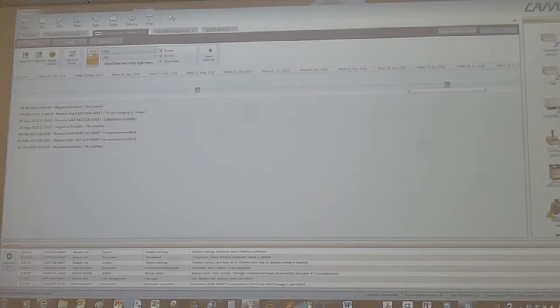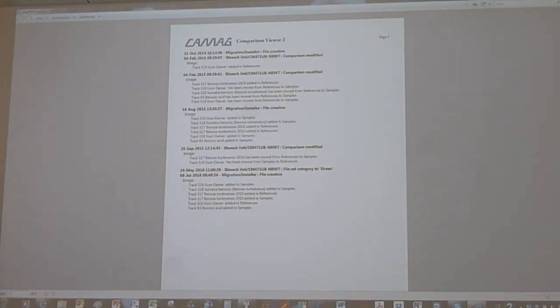So you can choose the date, you can export in a PDF or in an XPS. So that means sure, not in an Excel or Word, but you can do that afterwards. But anyway, from the software you can export them to a non-changeable format.